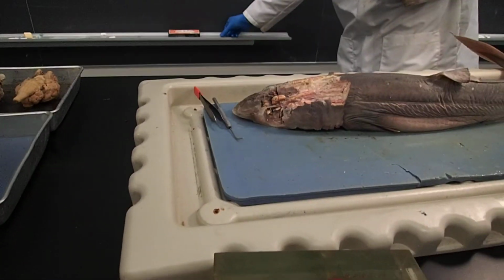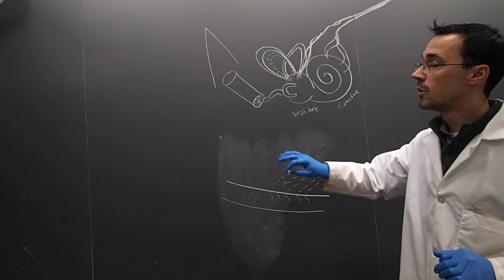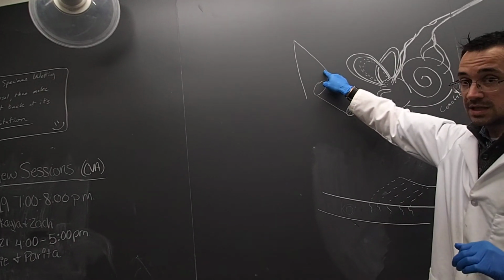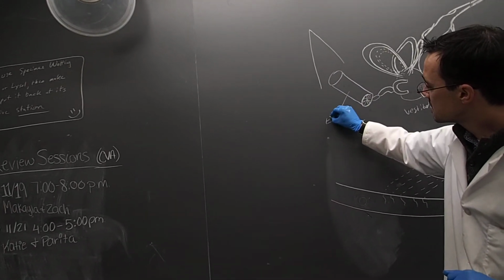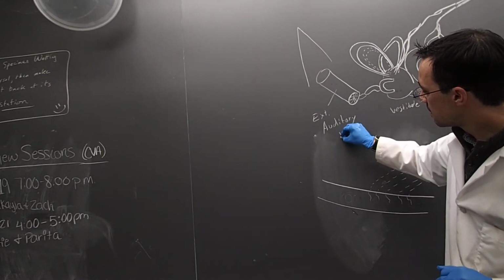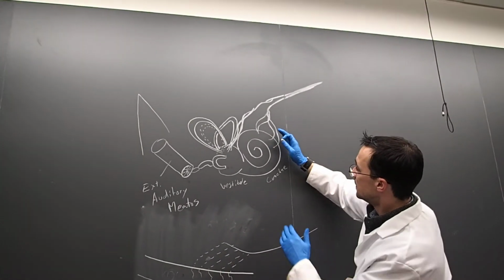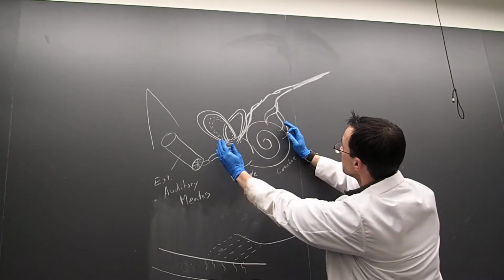Okay. Just because we're not going to get to it later, within your handouts, you need to know a few more terms for the cat. You need to know that this is the pinnae, that's the outer ear structure. This right here is the external auditory meatus. This is all within the otic capsule, these structures.